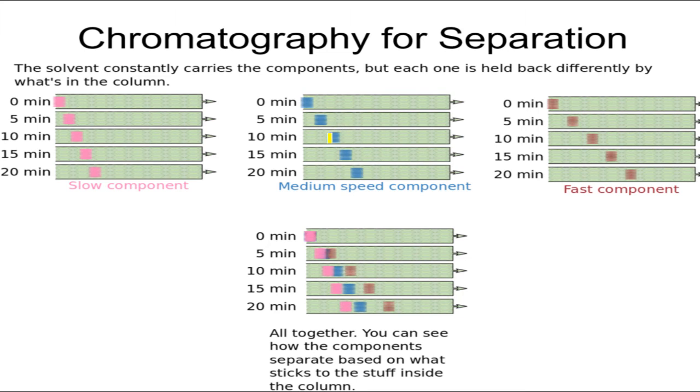to the sandiness. They'll flow, but they still stick, and eventually they get out. So after 5 minutes, it'll get here. 15 minutes, it gets here. 20 minutes, it gets here. This is a little farther than the slow component because this really sticks to the sandiness. This does not stick as much. It sticks there, but not as much.